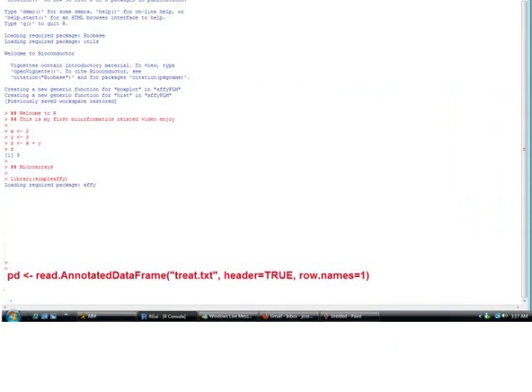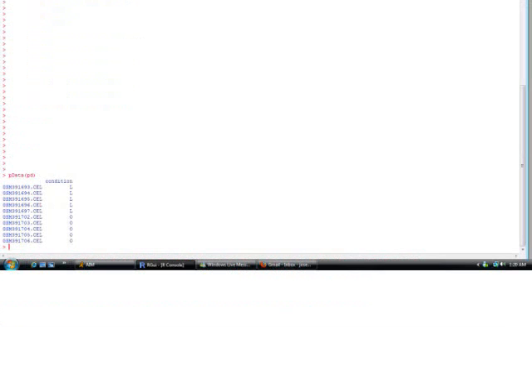So here we see again, this is how we read in the covdesc file, pd which is phenotype data, read.AnnotatedDataFrame is the function used by SimpleAffy, treat.txt, header equals true, row.names equals one.